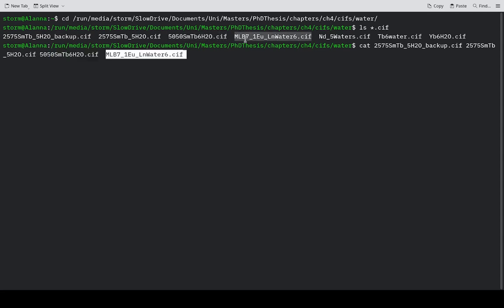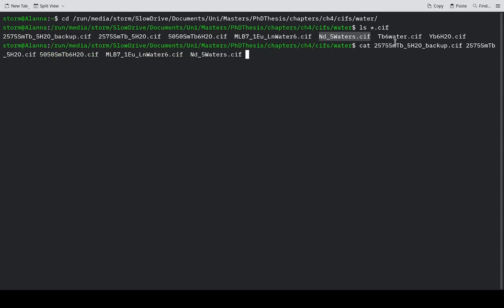Then, in the order you want, list out all the file names you want.